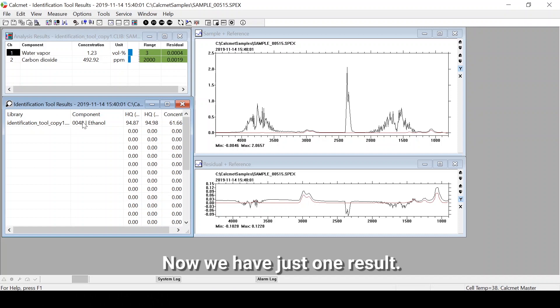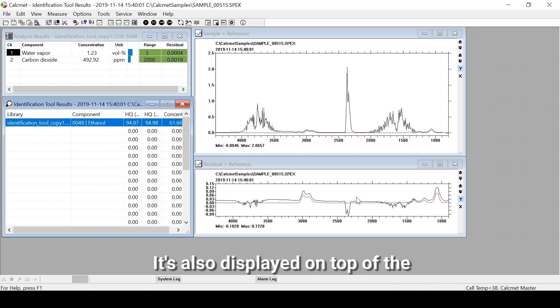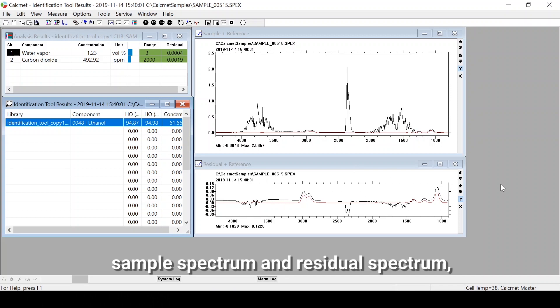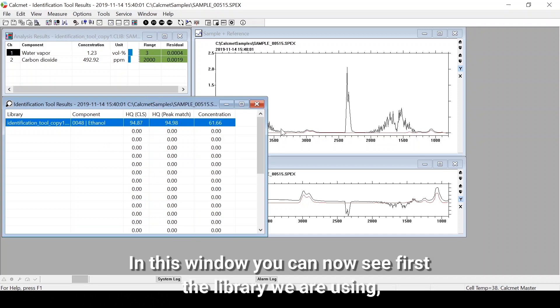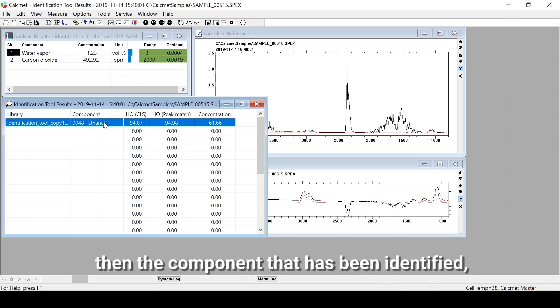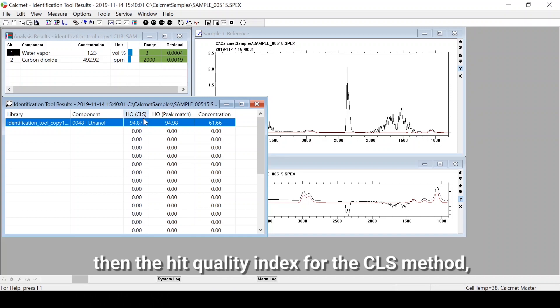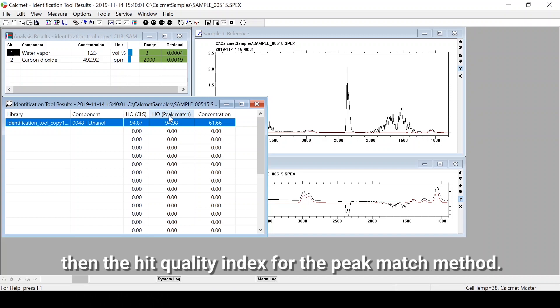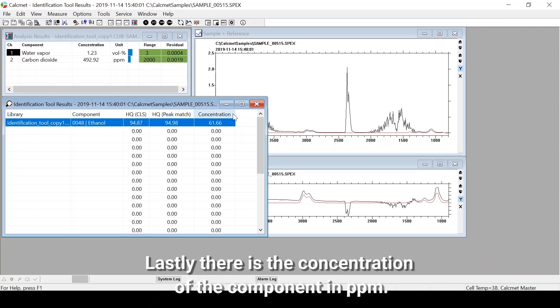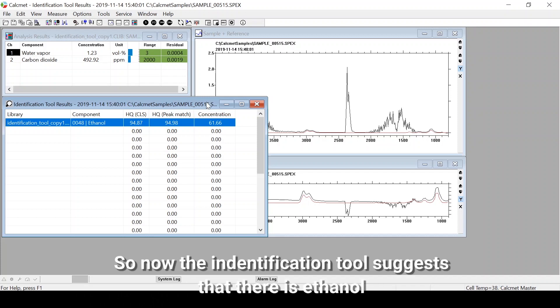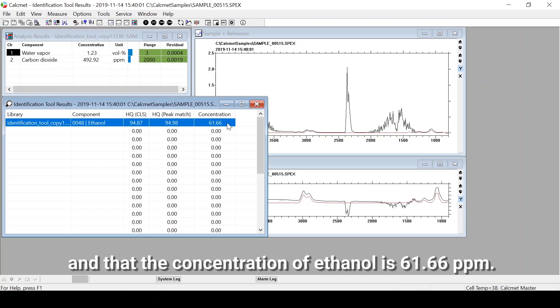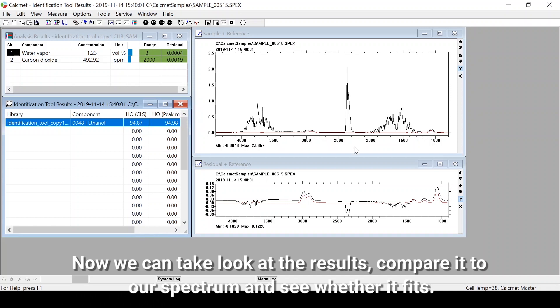We have just one result, which is also displayed on top of the sample spectrum and the residual spectrum so you can review whether it fits the peaks. In the results window you can see the library being used, the identified component, the hit quality index for the CLS method, the hit quality index for the Peak Match method, and lastly the concentration of the component in ppm. The identification tool suggests that there is ethanol at a concentration of 61.66 ppm.